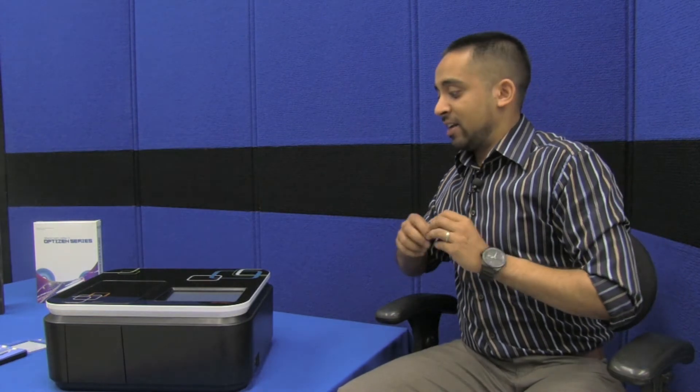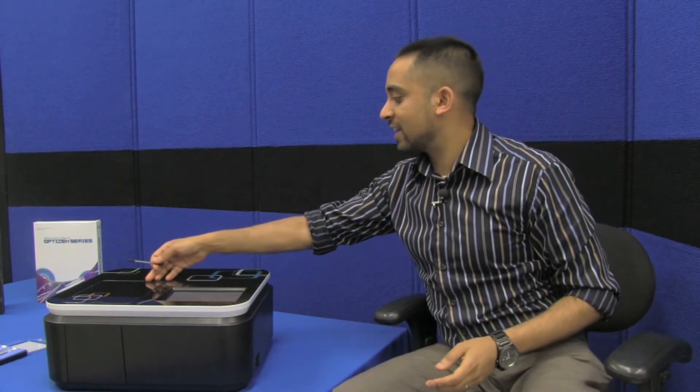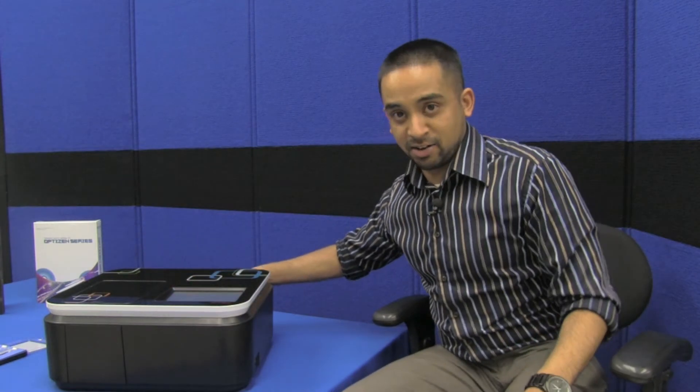Let's take a look at the instrument in a little more detail. We're going to take a look at the operation, the functionality, and the connectivity. Let's start off by taking a look inside.